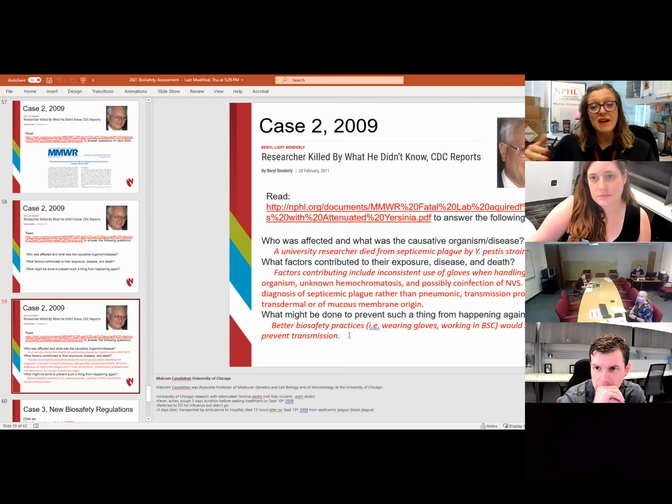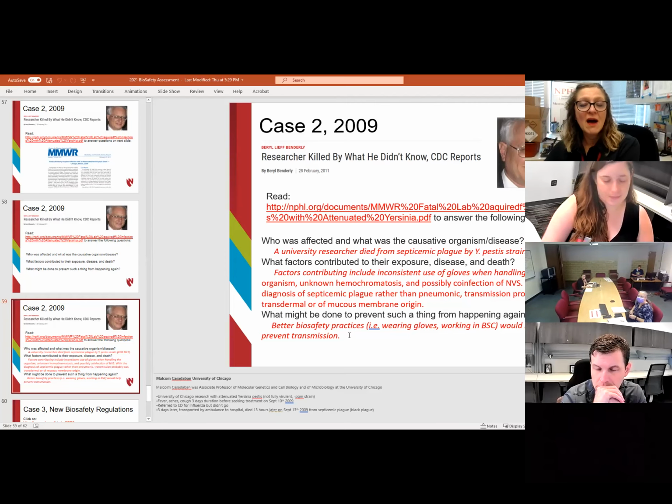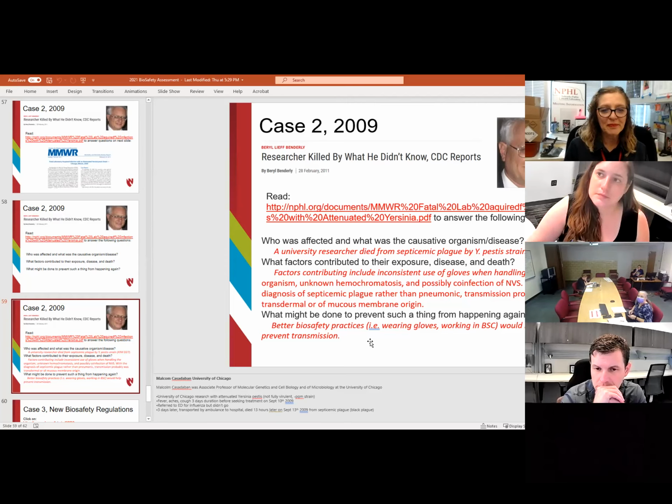And they, with their treks just across the back, can pull organism out from that biosafety cabinet, which then again makes you susceptible. So I have asked our biosafety officer to sit in and answer any questions that you guys might have.